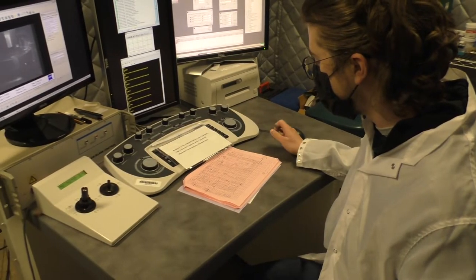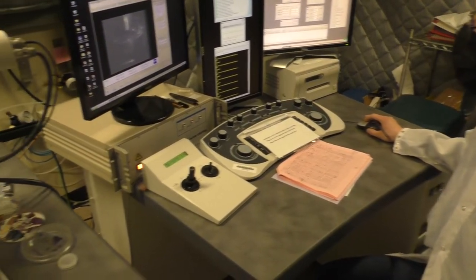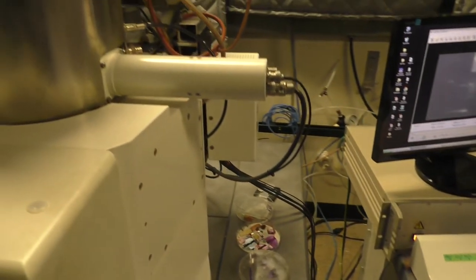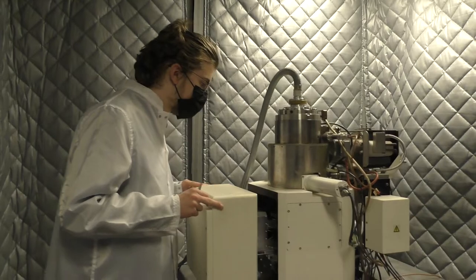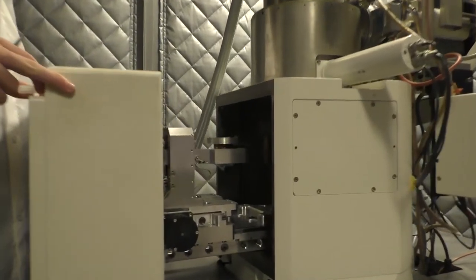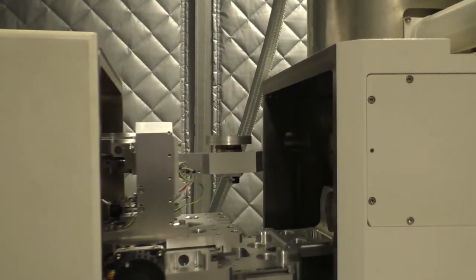Therefore, we use the SEM. To load the sample, we ventilate the sample chamber. After the chamber is vented, we place the sample on a motorized stage. Then we evacuate the sample chamber.